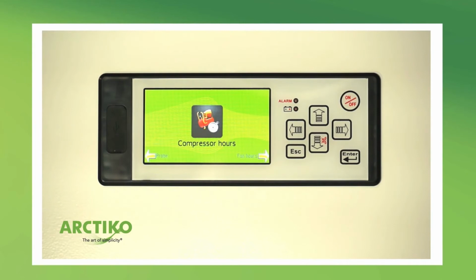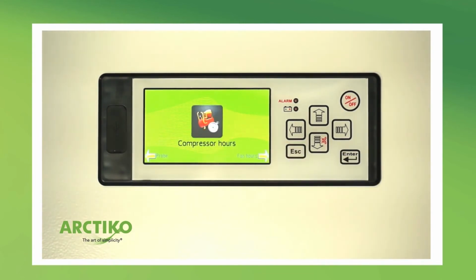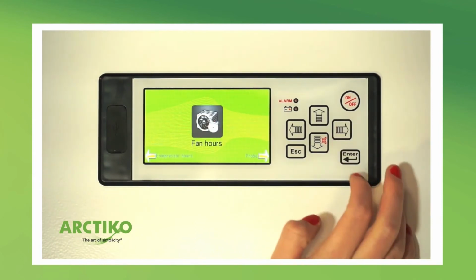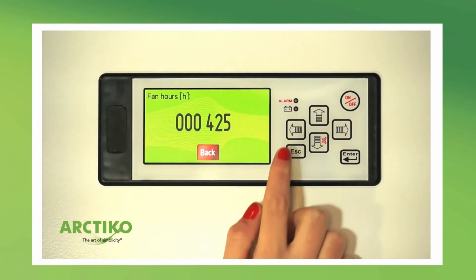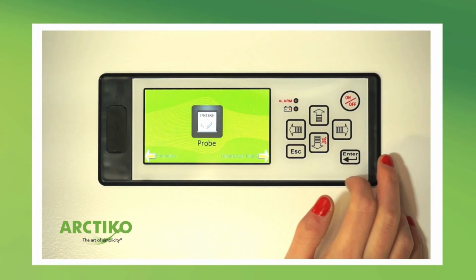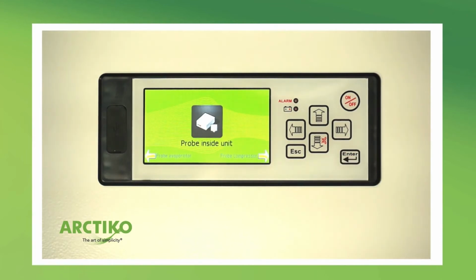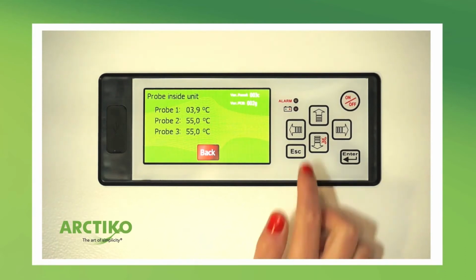Compressor hours shows how many hours the compressor has run. Fan hours shows how many hours the fan has run. Probe displays the temperature for the sensor mounted in the unit. Probe inside unit displays the temperature of the sensor mounted inside the unit. One sensor is mounted in the unit as standard. 2 extra sensors can be mounted inside the unit.